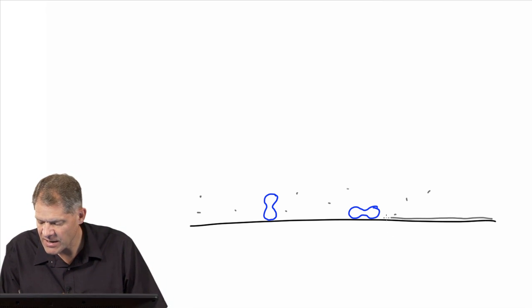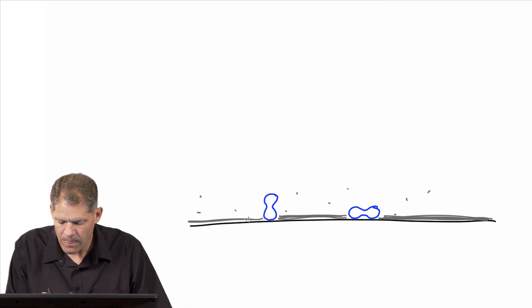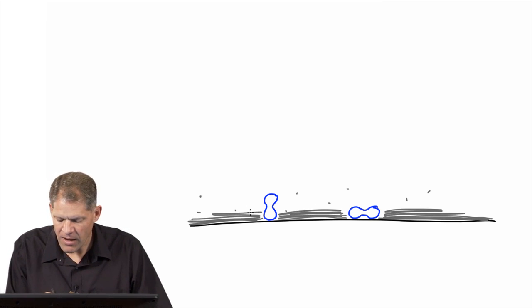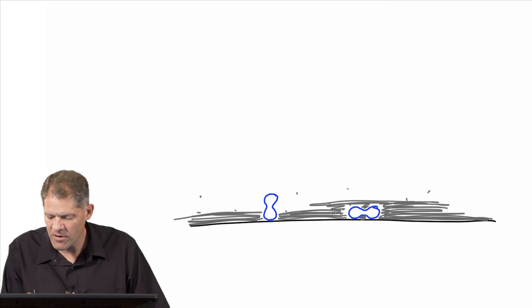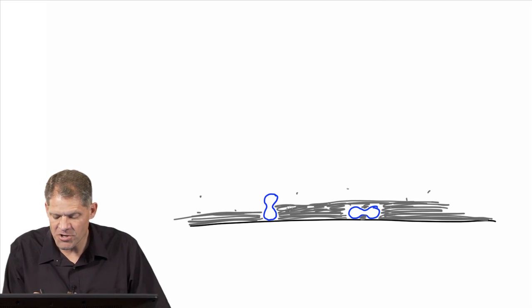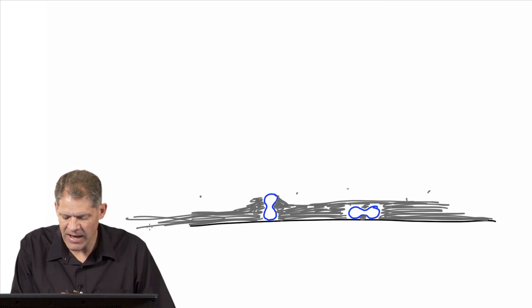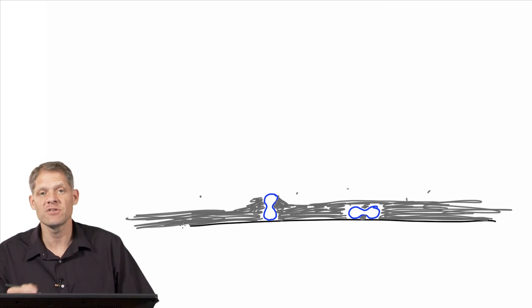And as they precipitate, they form a film here along the grid, and the film gets deeper and deeper and surrounds the proteins. And ideally, for instance, for a short protein, the film of negative stain would completely cover the protein. What's seen with larger proteins or complexes is that often a little meniscus forms around the protein where the stain is extra deep, and then it has its standard thickness elsewhere. And so this is what the grid might look like after the stain dries.